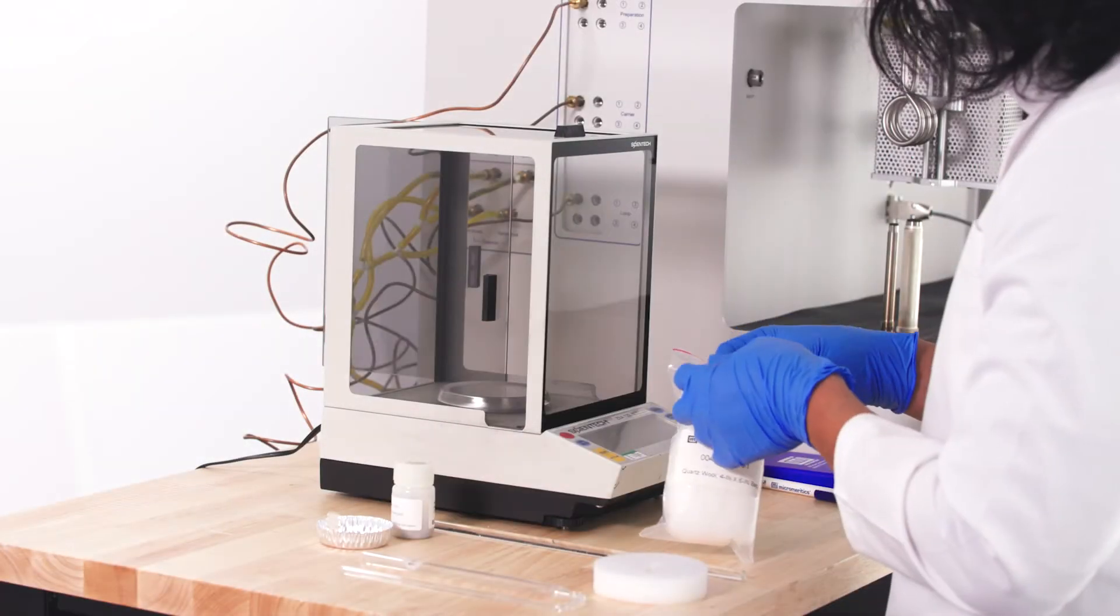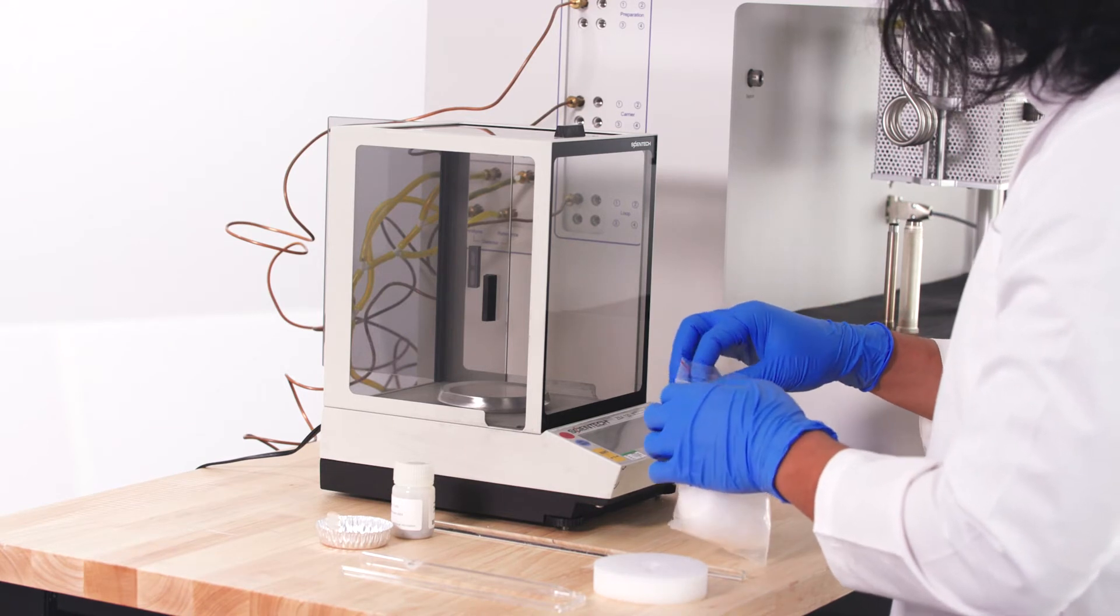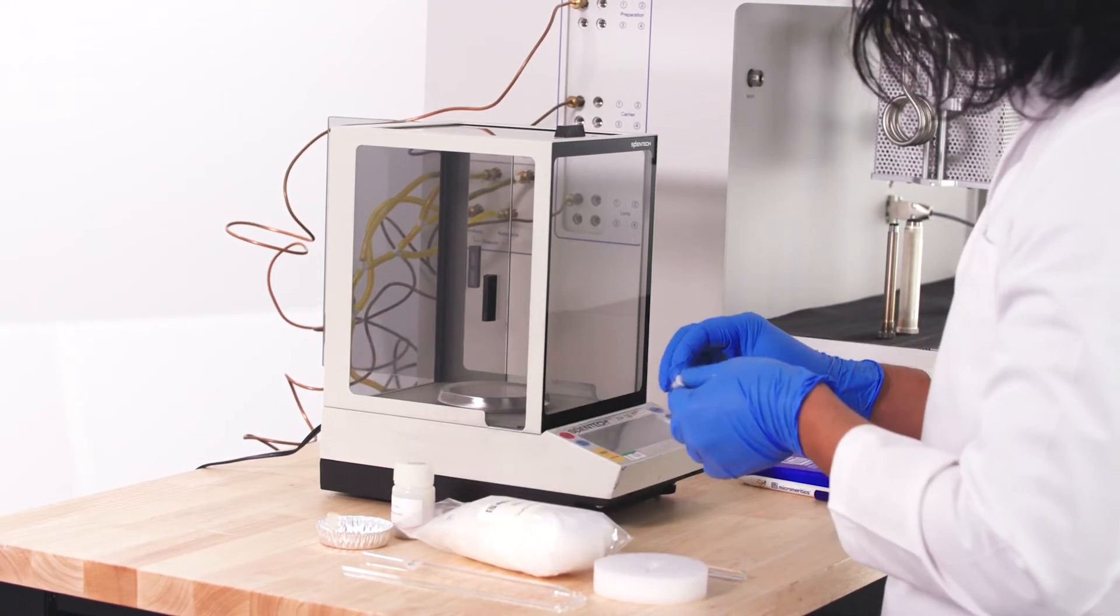Now we are ready to prepare the sample. Place a small amount of quartz wool at the bottom of the sample tube with the provided glass rod.